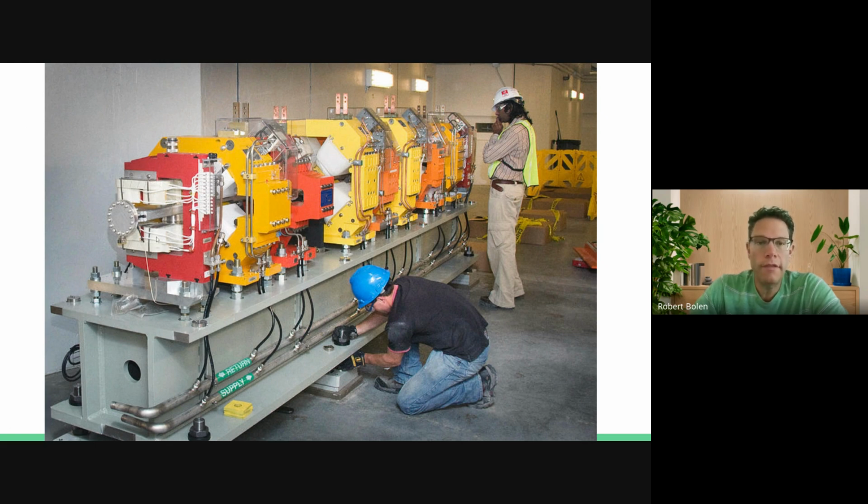Okay, and the white things here are the magnets, so that's a dipole. The yellow one here, I think, is a quadrupole, and then the red one and the orange one there. The orange one has six magnets in it. So there's a lot that goes into making this happen.